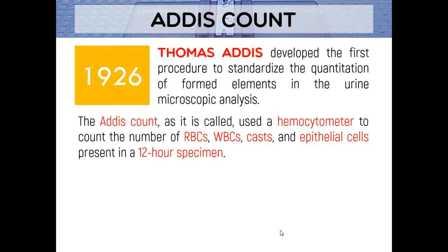Now, ang Addis count, we use a hemocytometer or a hemacytometer. Yes naman. So, confident na ko na, you have that in your HEMA 1. So, medyo familiar na with your hemocytometer, no? Yeah, I hate that. Joke lang. Again, yeah, nana mo ana. So, again, di na kayo foreign in yung hemocytometer.